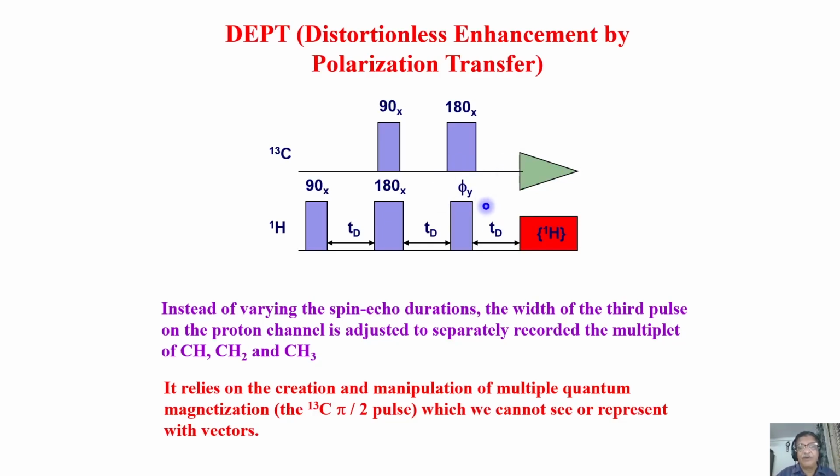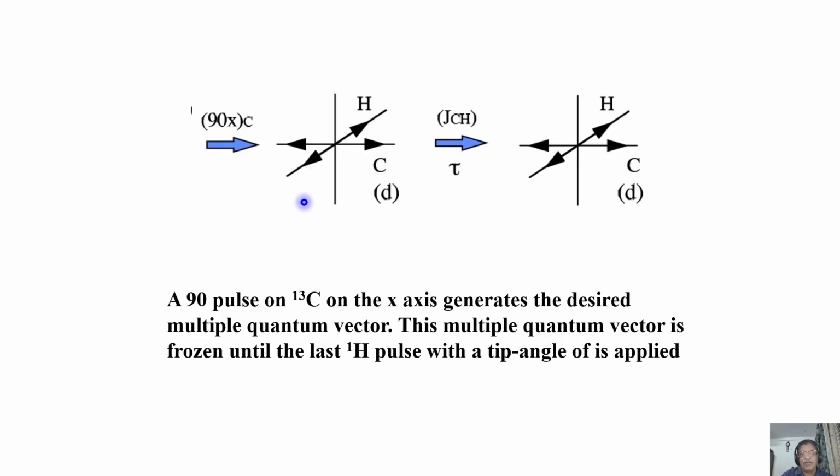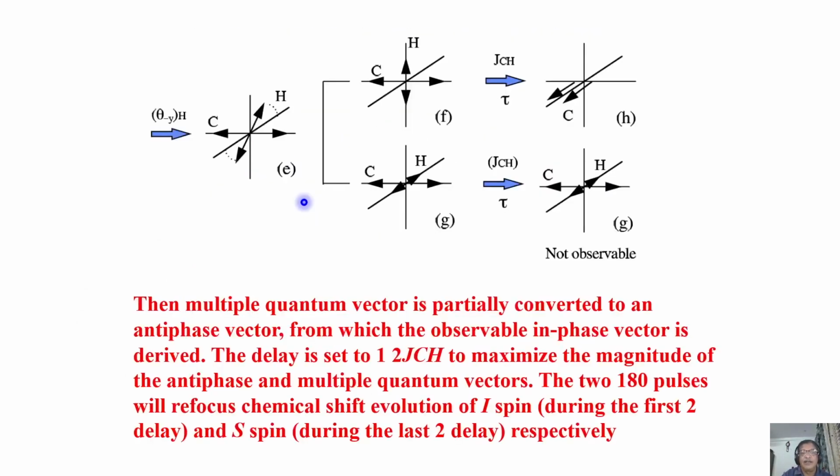Okay. What we do is, for the identification of protons attached to different carbons, we do only 3 types of experiments. In each experiment, only phi is varied; all other things remain constant. Of course, to some extent it is given first. I will not go into that. I will come to this in more detail later, because when I explain the INEPT polarization transfer, everything will be explained.